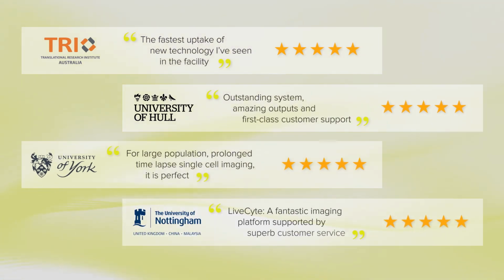Livecyte's installed in customer institutions around the world, and we've had some great feedback from our user base. Livecyte is a high-content live cell assay system, not just a label-free imaging system.